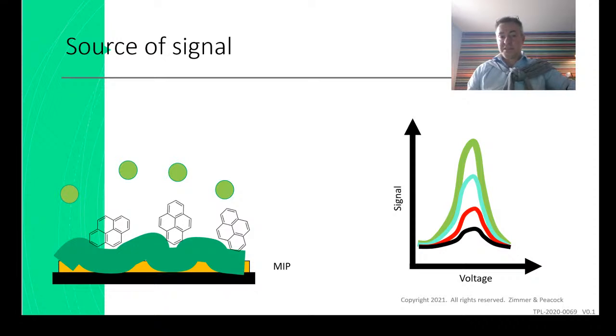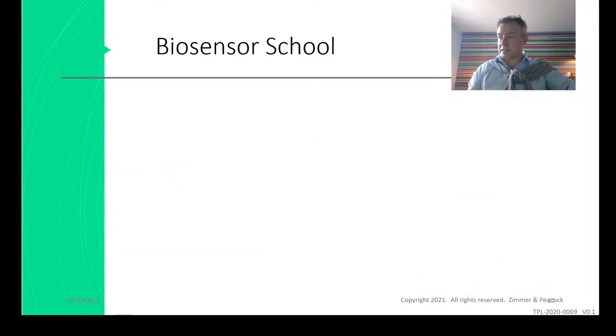And because this is done by HiSantosh, I know him very well. I suspect he used differential pulse voltammetry, but you could have done DPV, square wave voltammetry. Maybe cyclic voltammetry wasn't as good, but he would have done that. And then he would have had a signal peak height versus concentration. So I think that really helps. Just follow the paper, and it's an easy enough paper to follow, and it's quite robust.